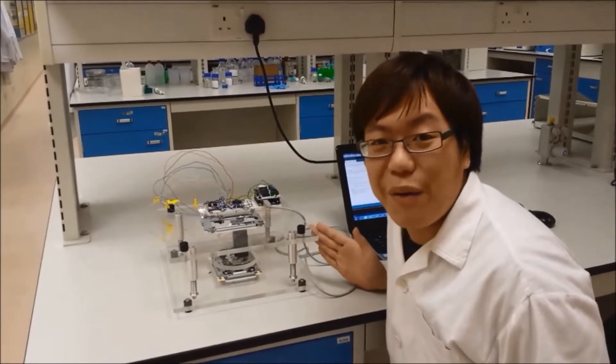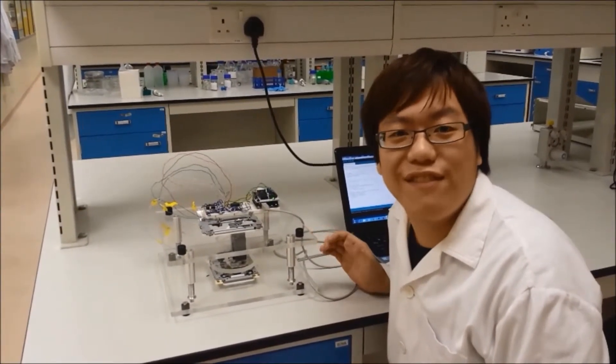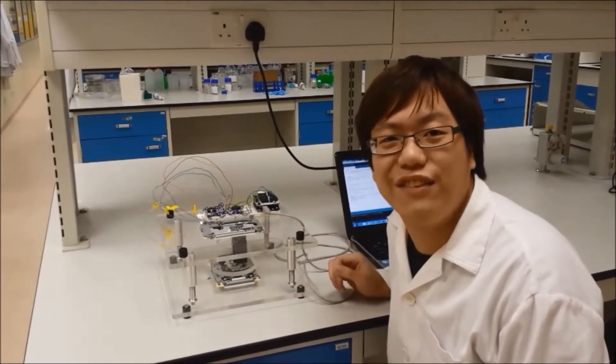So there you have it, the DIY bioprinter. A promising future for the bioindustry. Hopefully, we can even print functional organs out of it.